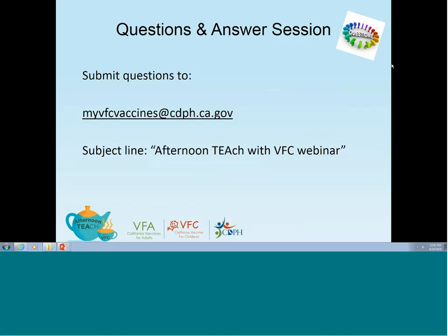Another thing that you could do is you could get your backup data logger and put it in the unit and start comparing the temperatures. And if you're still having problems with having excursions, I would give the call center a call here. It's the VFC call center. And I would also reach out to the manufacturer and see if maybe there might be something wrong with that particular data logger.